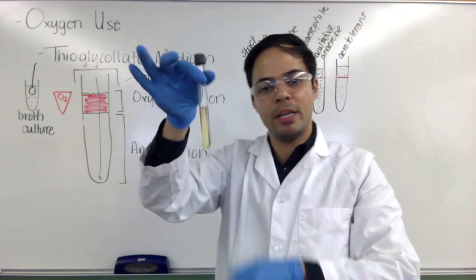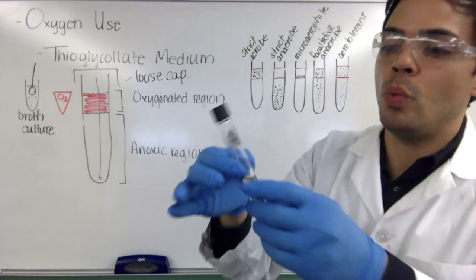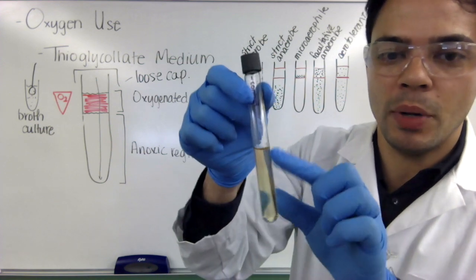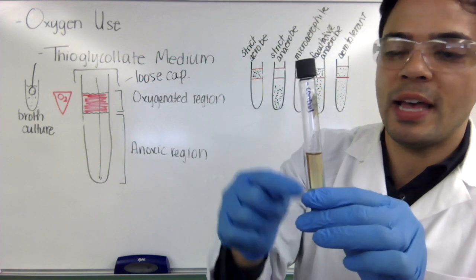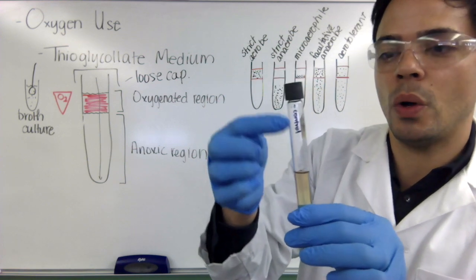And once you're done, make sure the tube is labeled. Now you want to label your tubes at the top, not the bottom. And that's because we don't want to obscure the region that we are going to be observing. So always write up top.